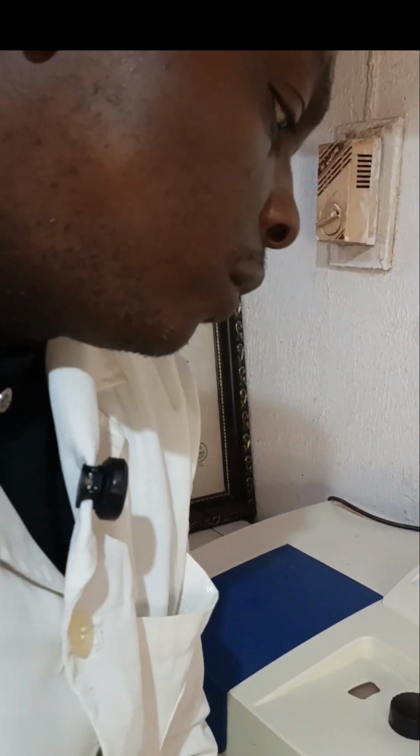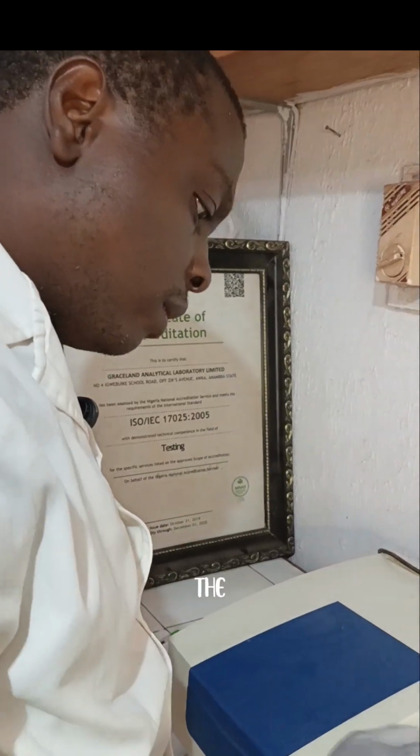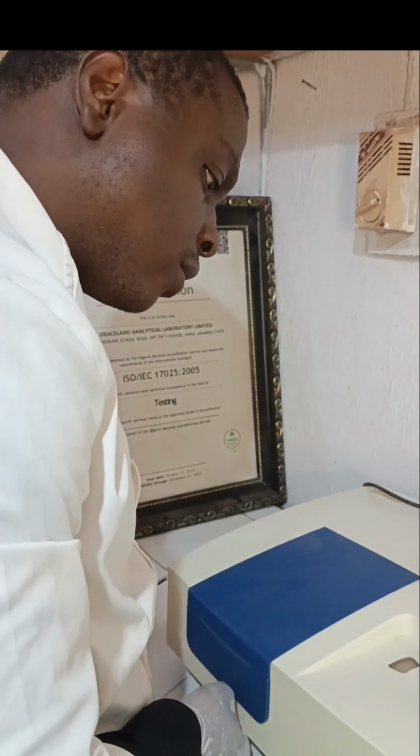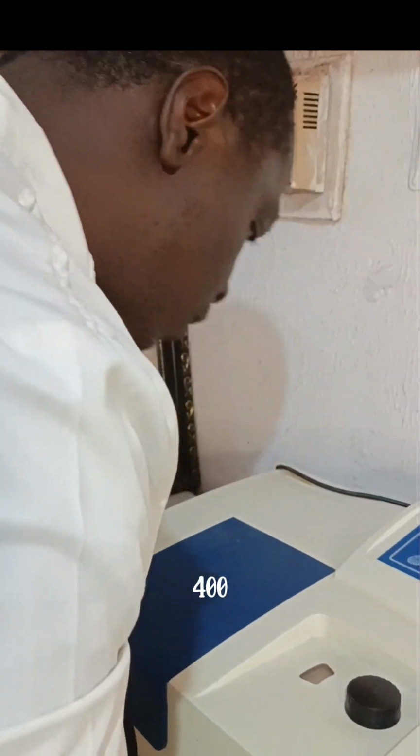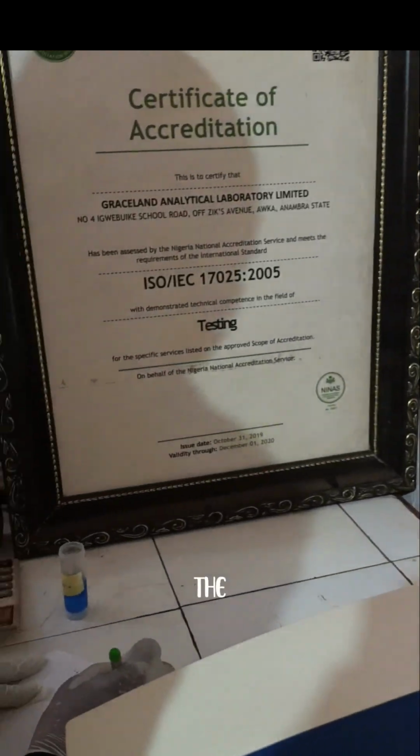The next thing we'll do is to start changing the wavelengths. So at 400 nanometers, we got the absorbance to be 0.95.